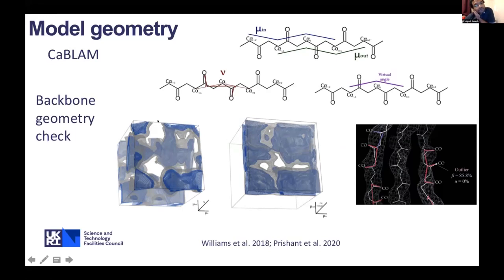So this is a set of favored conformations in both 3D and 2D space based on these pseudodihedrals. And if your model regions fall in the favored space, like how we look at the Ramachandran maps, we can identify outliers here and so on.